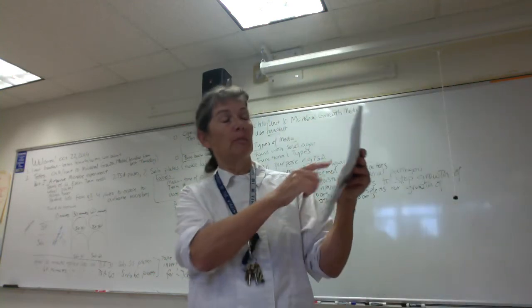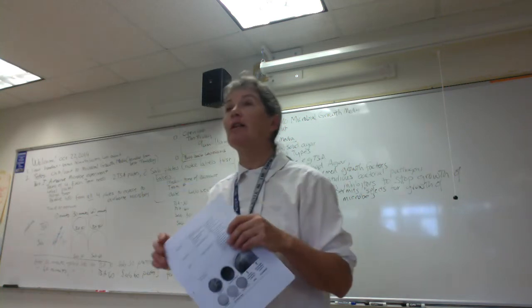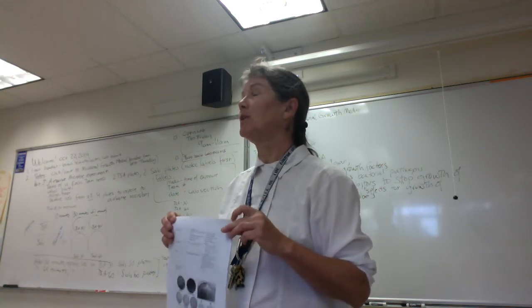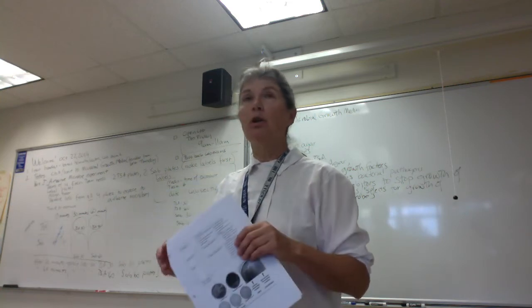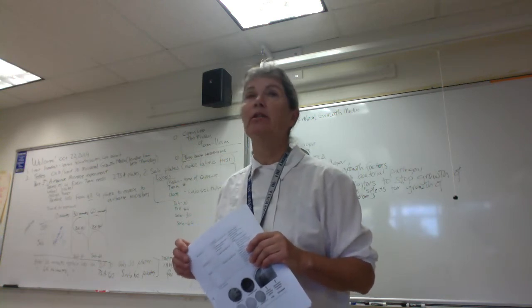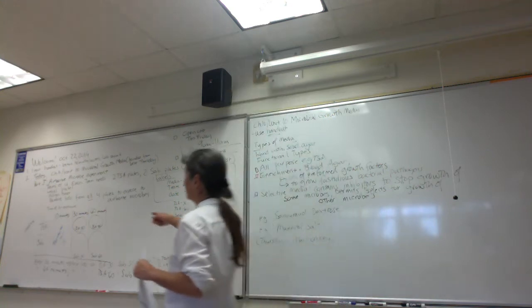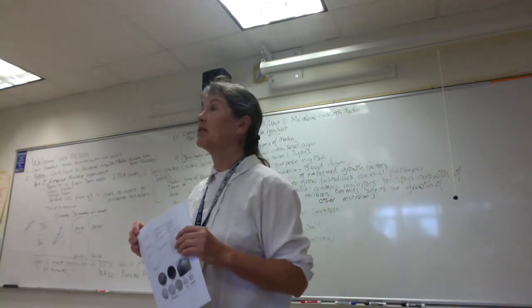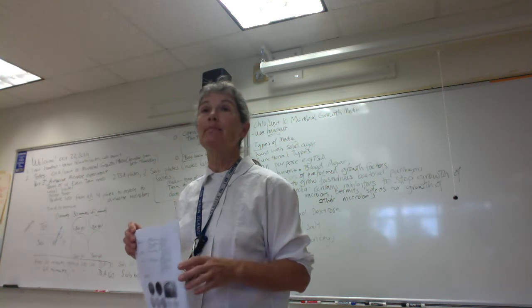Okay, folks, now again we're on page 2, and it says classifying media by its functional type. And this is a classic lab exam question where we'll have at a station different types of media that we'll be talking about this week, and we'll ask you to classify them. All right, so let's use some of the terms. So folks, all-purpose media is media that can support the growth of a wide range of bacteria and fungi, right? So the all-purpose medium we're using today is the tryptic soy agar, right? So we're going to predict that you guys will be growing both bacteria and fungi on your TSA, your all-purpose medium, and the fungi would include both molds and yeasts, okay?